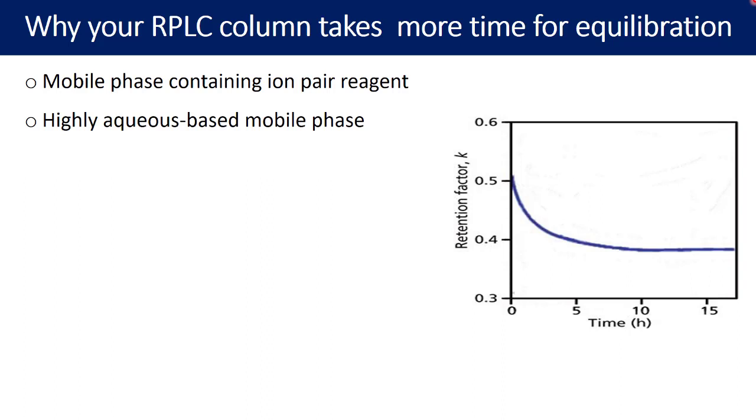The second reason behind longer equilibration time is a highly aqueous based mobile phase. In reverse phase chromatography, the mobile phase is polar while the stationary phase — such as C8 or C18 — is non-polar, oil-like, and not miscible with water. These stationary phases will not get easily wetted by water alone. Wetting of the stationary phase is essential for partitioning and desorption. If the mobile phase contains only water and buffer, de-wetting of the C8 or C18 stationary phase will occur.